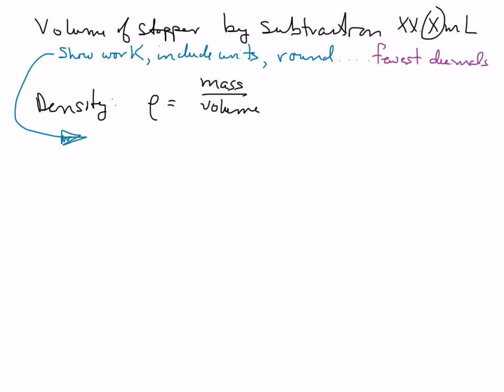That's my mass. Now, as I've been doing this, you might think maybe you want to get the mass of your stopper before you get it wet. Maybe. Either that, or pull it out and dry it really well and then get the mass. So you need the mass of those two objects. Then you're ready to knock out the density.